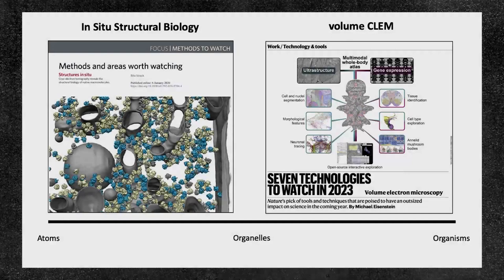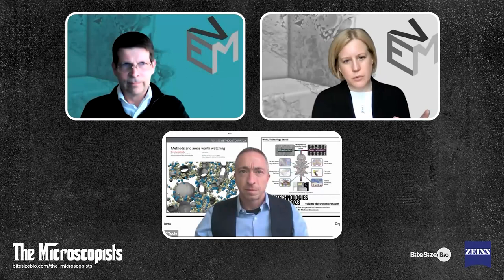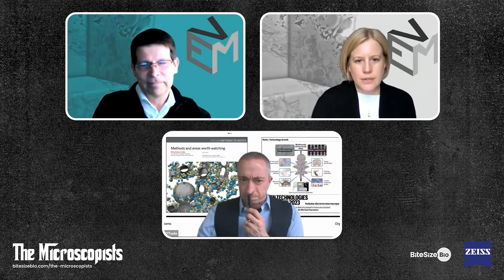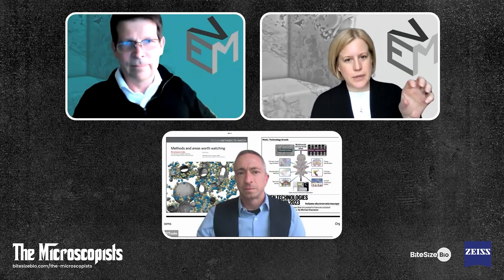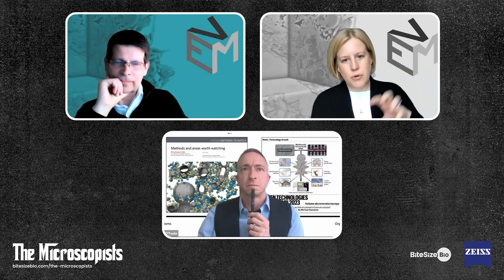these. Yes. So I think this is another big challenge. So the delivery of the mind of the mouse is one, and the first effort will be delivering the structure of the connections between the neurons. But then you have interesting areas here in correlative and multimodal imaging. So that's where you connect different types of imaging together, like light microscopy, X-ray microscopy, ion microscopy, and electron microscopy. And you start to layer different types of information on top of each other. So that might be showing you where the molecules are in the brain, or where chemicals are in the brain.